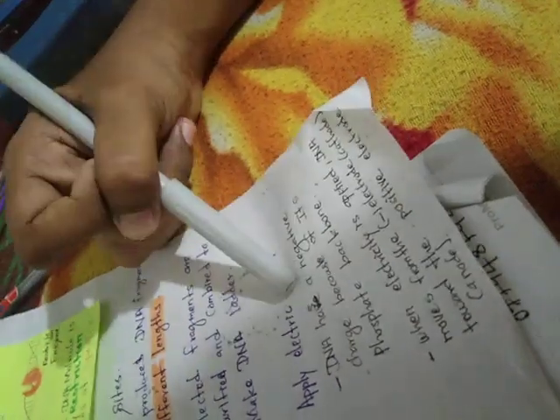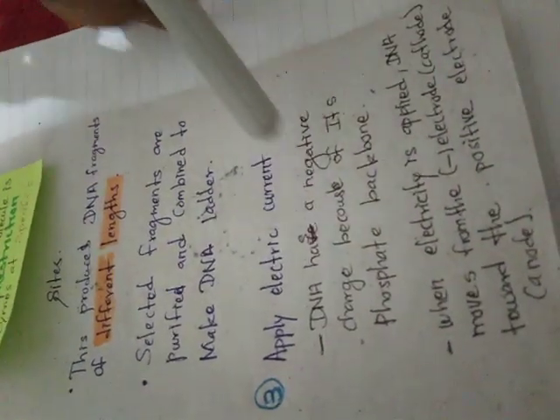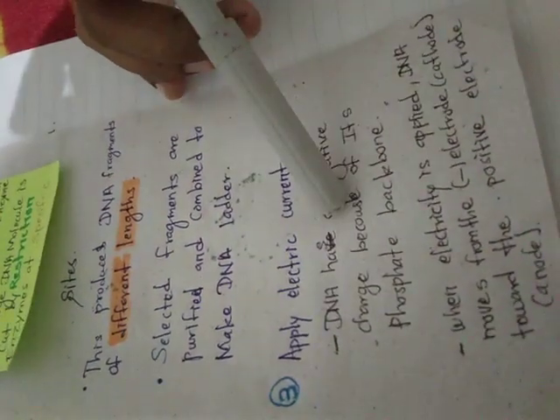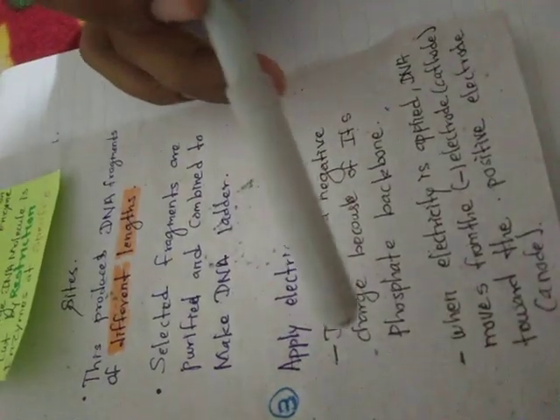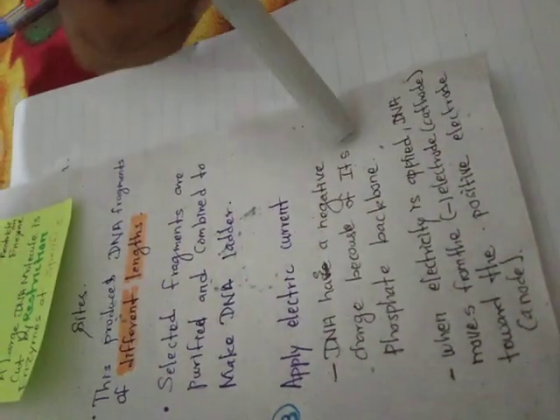Then the third process. What is the third process? Apply electric current. Otherwise they can't move, no. So we have to apply an electric field. DNA has a negative charge because of its phosphate backbone. I already said, DNA has a negative charge.